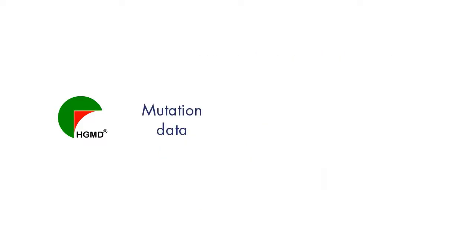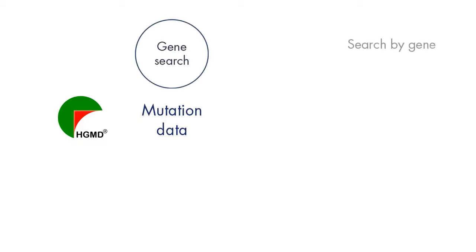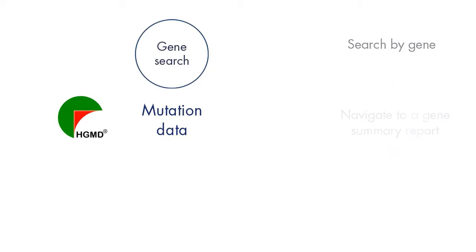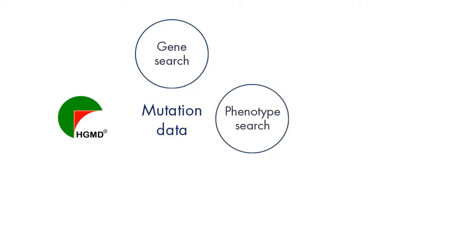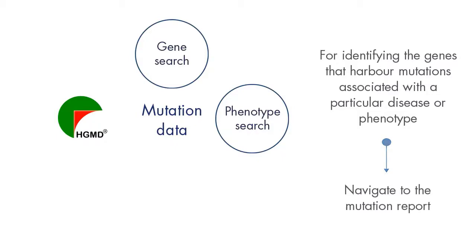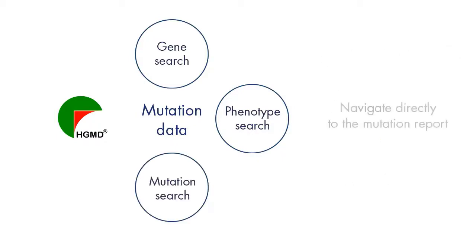The core of the HGMD database is the mutation data, which is easily accessed by three basic search approaches. The first is a gene-centric approach, where you search by gene, navigate to a gene summary report, and then navigate to the mutation report by clicking on the specific mutations listed for the gene. The second is phenotype-centric, which is helpful for identifying the genes that harbor mutations associated with a particular disease or phenotype, and ultimately their associated mutations. Using the third, mutation-centric approach, you can directly search for specific mutations.